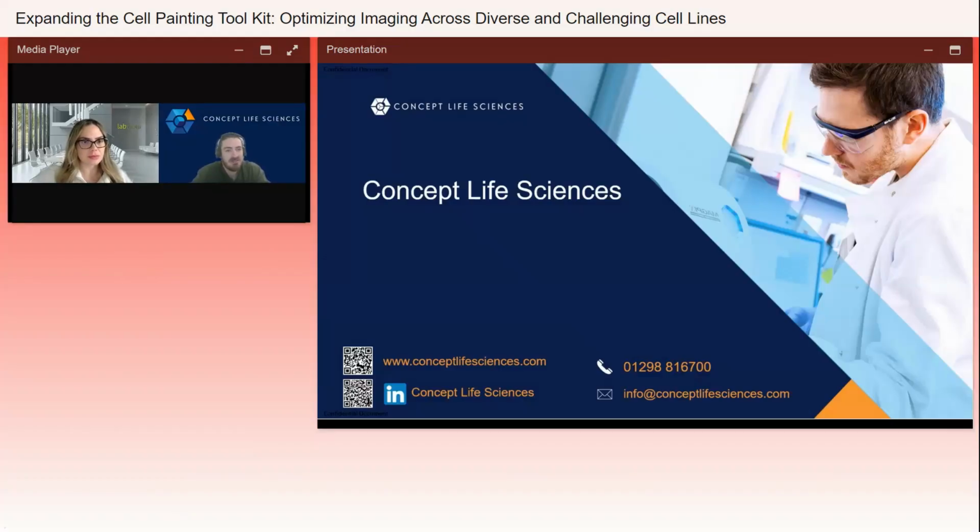In theory, you can't, because this again comes to where you'd need the reference compounds that you'd have on the plates. Without looking at the images, you wouldn't know what type of changes are being induced unless you have those reference compounds that are consistent across cell lines. If they have the same effect, then a cluster that is appearing right next to, say, a staurosporine treated well might very well have a similar phenotype there that you can identify even without having to look at the images. The images are really a nice way of confirming what the underlying data is showing you. It's an added validation step, if you wish.